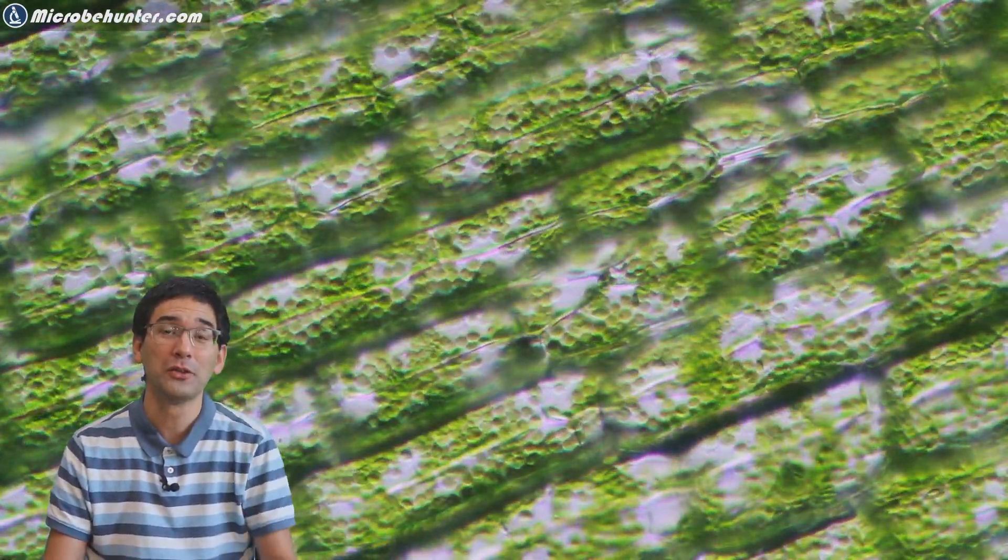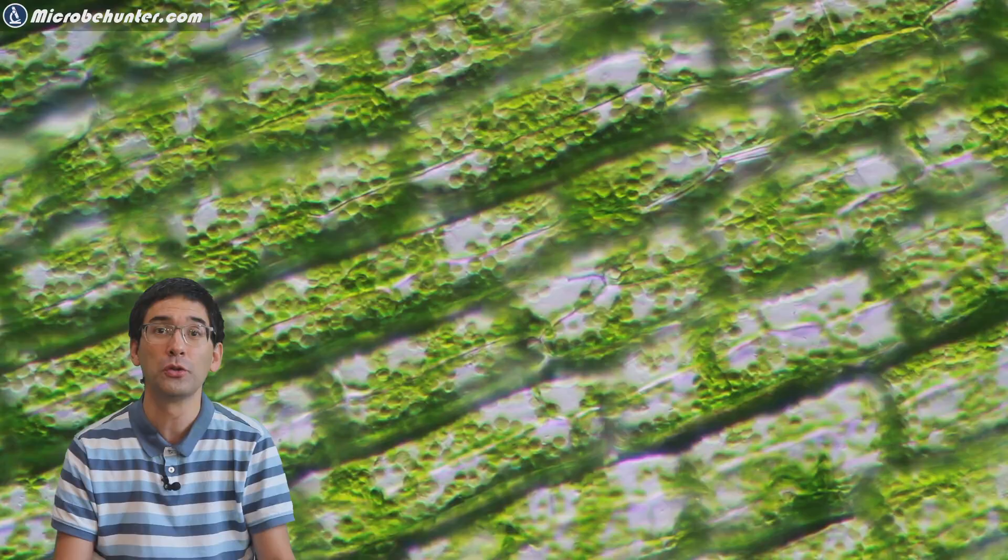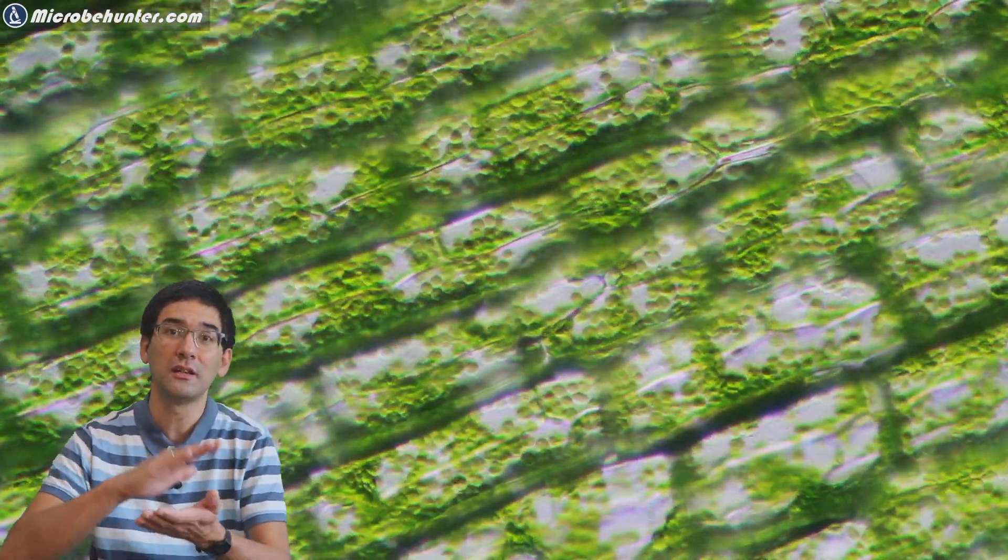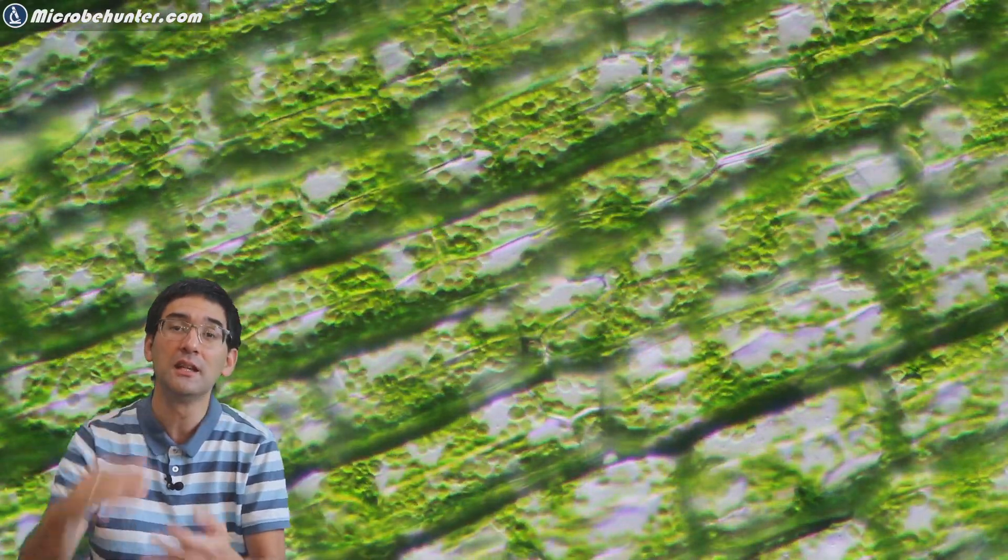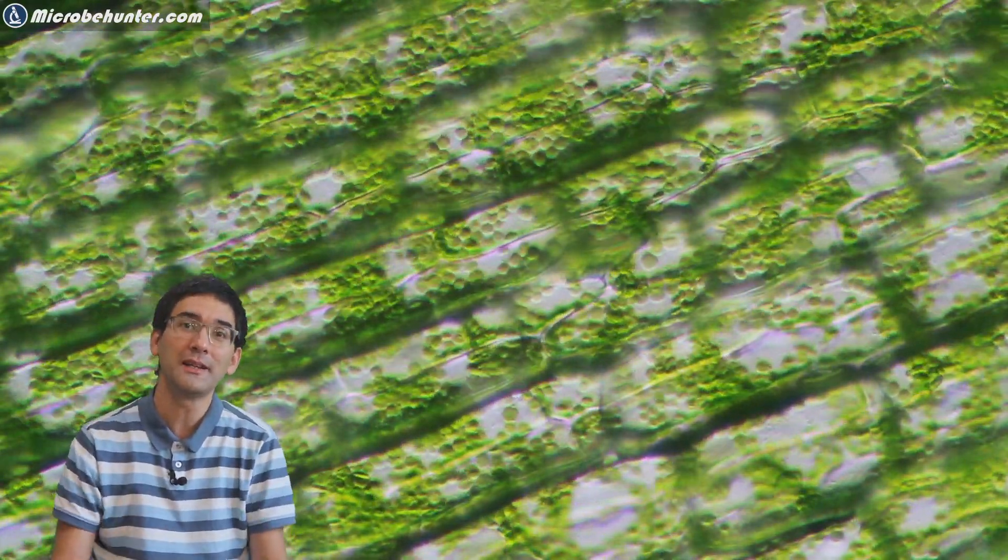You can also try to do that with moss. Moss also has very thin leaves and it's also suitable. But many other plants, you won't see a lot. The reason is that the leaf is several cell layers thick. It takes away all of the light and you're just going to see darkness and no cellular structure, no chloroplasts because everything's covered up in a dark shadow. And that's the reason why this water plant is so extremely suitable.